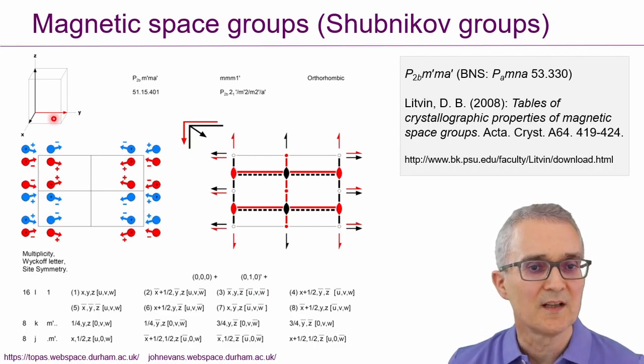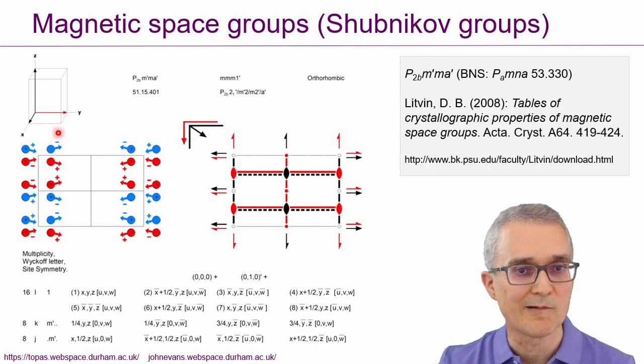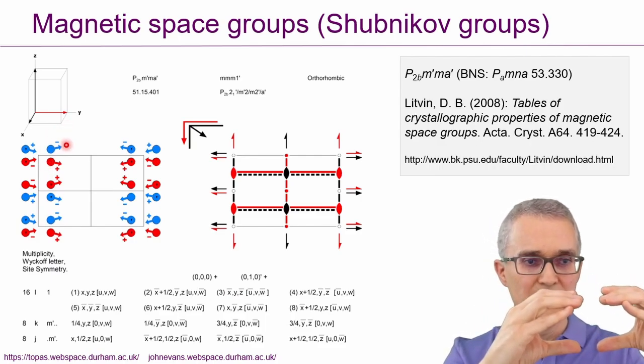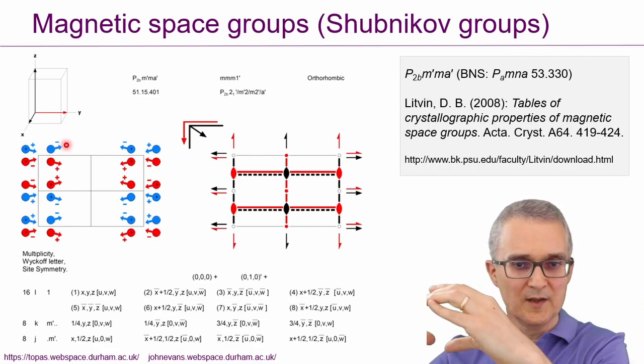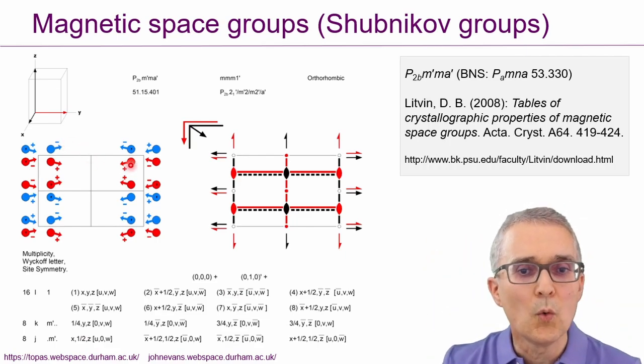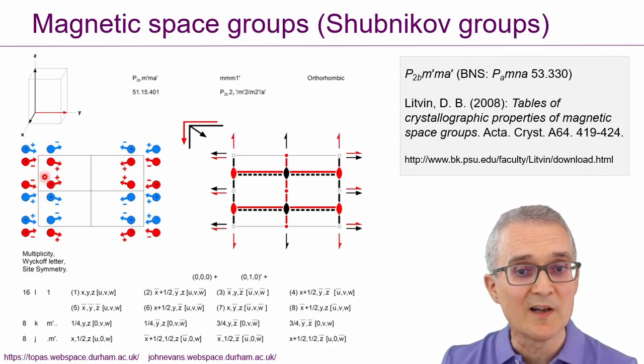So the unit cell of the material is actually twice as large as the unit cell that's drawn here along the b direction. You would actually have a copy of this part of the unit cell translated along in the b direction, and the copy has all of the symmetry operators primed relative to the portion that's drawn in the diagram.